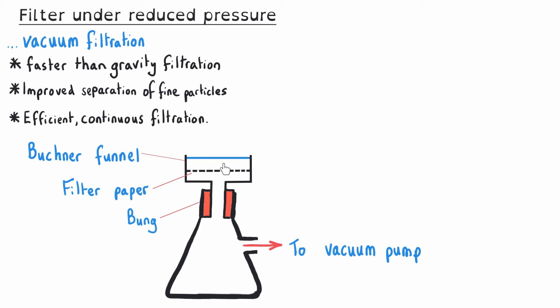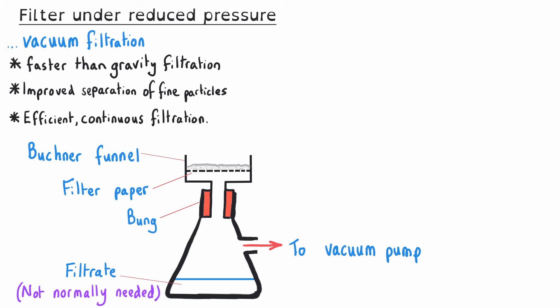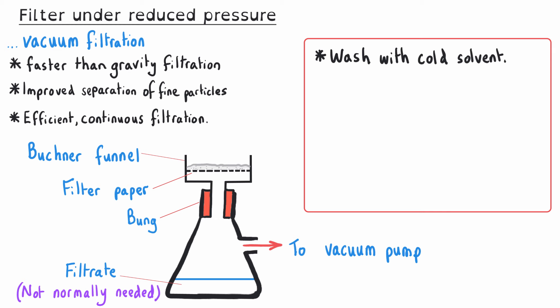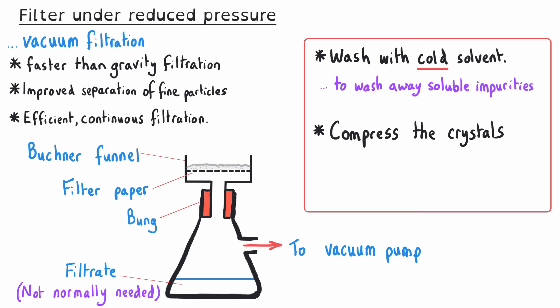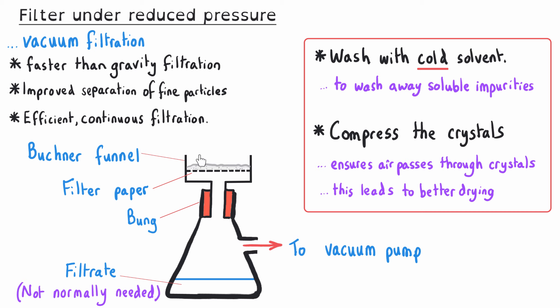We pour the liquid containing the solid into the top of the Buchner funnel and turn on the vacuum pump — sometimes as simple as turning on a tap and allowing the movement of water to pull the liquid down into the conical flask. The filtrate moves through the filter paper into the flask, while the solid is left behind on the filter paper. We wash our solid with cold solvent — typically the same solvent used earlier in the synthesis — using cold solvent being crucial because warm or hot solvent could dissolve the aspirin we're trying to collect. Sometimes we compress the crystals on the filter paper to ensure air passes through the crystals rather than around them, leading to better and faster drying.